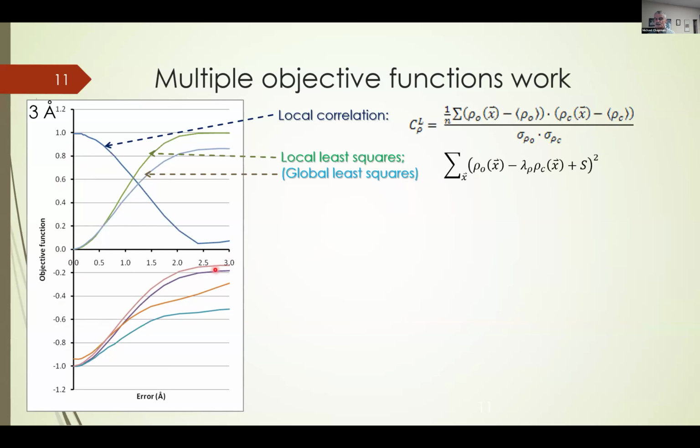We also have correlation coefficients that have a maximum at the true structure, unless we just flip the sign. These are correlation-based objective functions here with the sign flipped, so that the minimum is at the correct structure, which allows one to use library routines for minimization. Notice that the correlation coefficients have slightly wider convergence radius, but least squares is a bit more sensitive as you get close to the convergence. But viewed this way, both look like they will work.